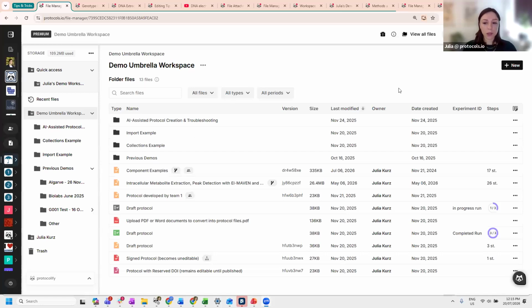Okay, so we are now on Protocol Studio in my demo workspace.